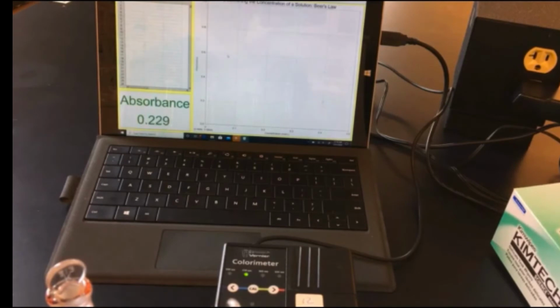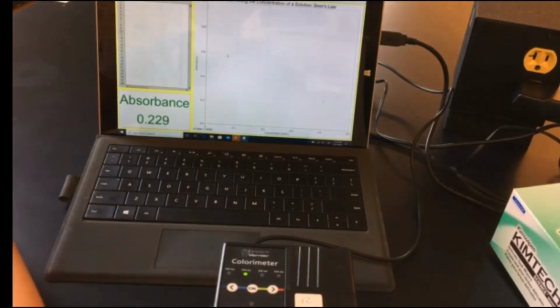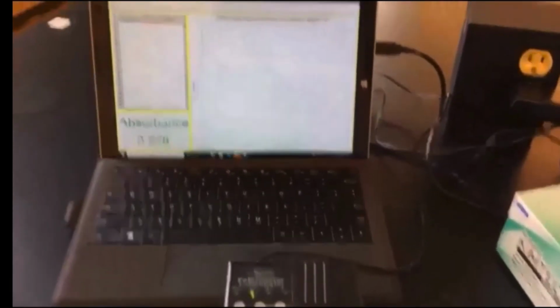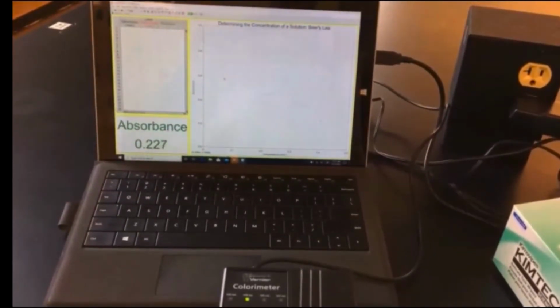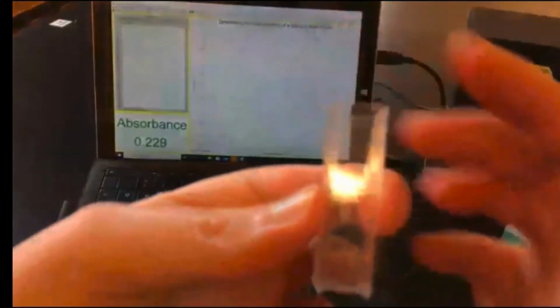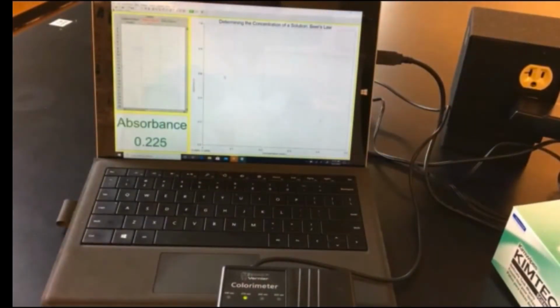So we are going to start by calibrating, and then we'll move on. So for this whole experiment, we're going to use 1 cuvette, and we're doing that so things are more accurate. So grab a Chem wipe, wiping again. So we have the clear side, which is where the light's going to shine through, and then the ridged side. So just wipe it in general.